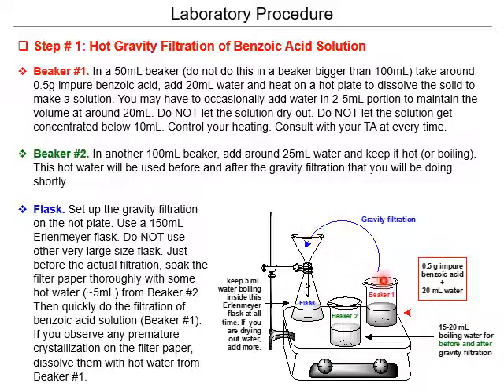It's sort of as if you're making coffee and you're putting coffee here, and you don't want to eat all the solid stuff that comes with coffee. You just want to drink the coffee eluate, right? Of course, you don't want to drink in the lab, but it's pretty much the same concept, right?